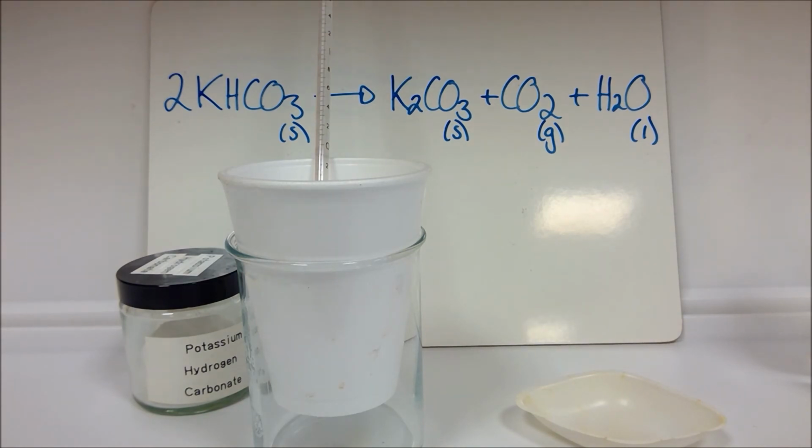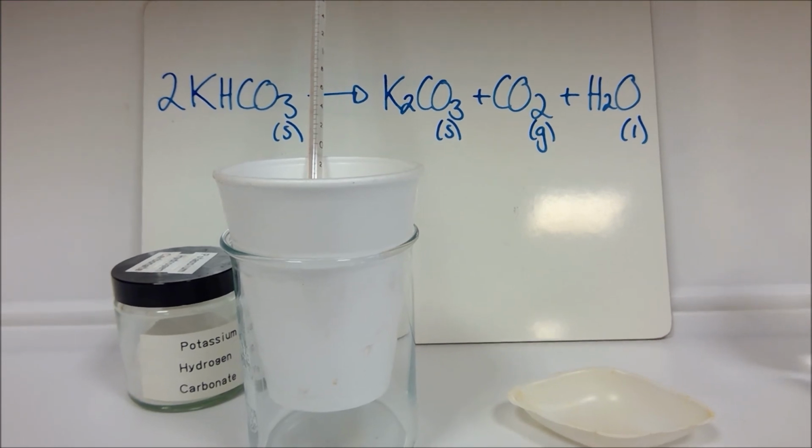So part 2 of the experiment is just to repeat the same thing, but with the potassium hydrogen carbonate. So I won't make you watch me do that. So you then need to have a suitable results table and to note down the readings that are given at the end of the video, and then work through your results, calculating the enthalpy changes for the two different reactions. So in the same manner as we have done with the enthalpy of neutralisation experiment and the magnesium in the hydrochloric acid experiment, using our temperature change. So work out the enthalpy changes in kilojoules per mole and then link these together in the Hess cycle.